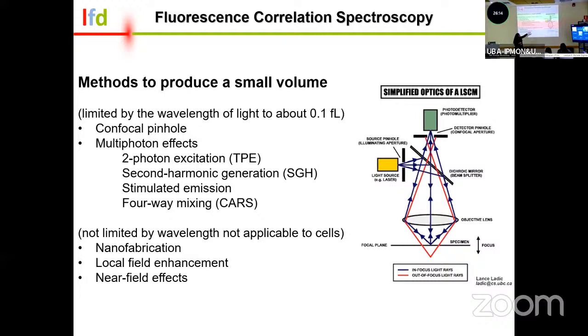Typically, when we're using confocal microscopy, we're using the laser light source, right? So we have a laser light, we have a lens to focus the beam onto this dichroic, and we're expanding the beam such that it goes through our objective. The objective focuses the beam to that small PSF right there. The emission will go back through this detector into, let's say in this case, some sort of photon counting detector, or you can also use cameras, but we can talk about camera FCS later. This is just for the principle of single photon detection.